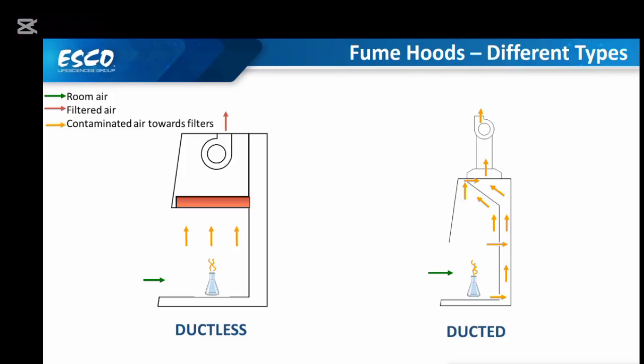Ductless fume hoods have a limited number of chemicals that can be used within them.